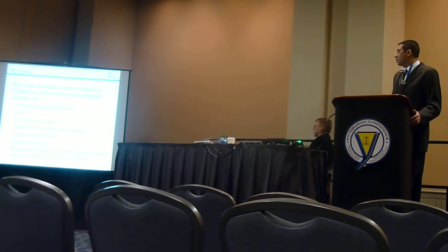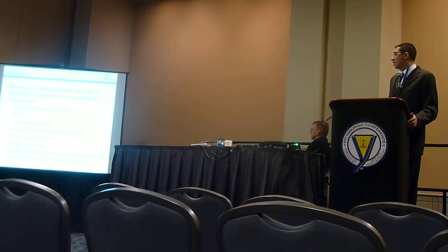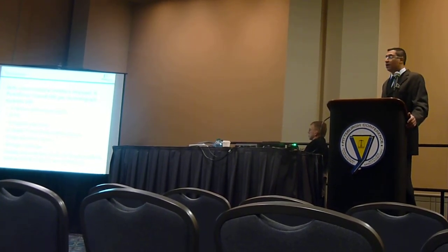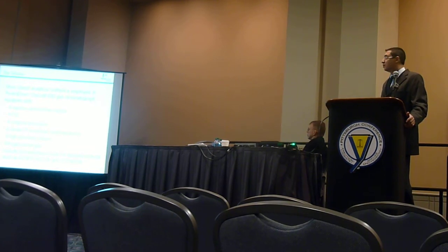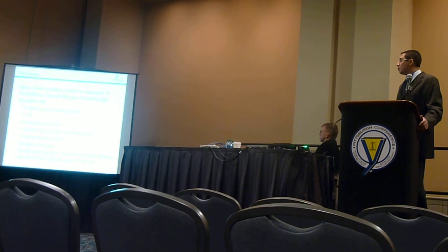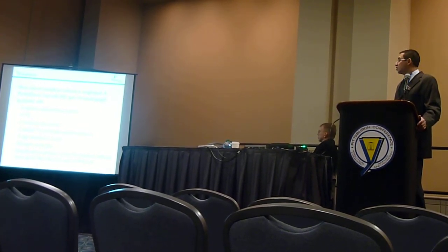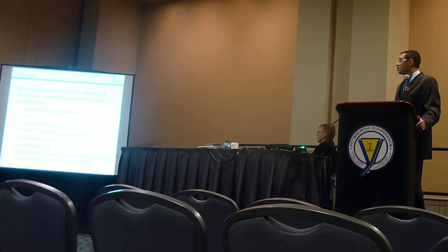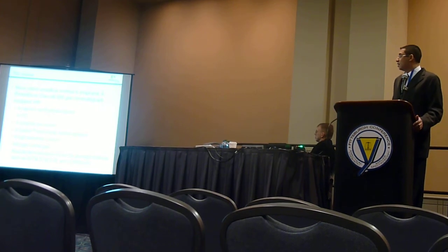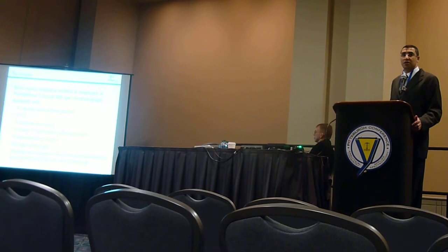So we employ the Clarus 680 PerkinElmer gas chromatograph. It has a split injector, a flame ionization detector, a non-polar pre-column that separates components based on boiling point, and then a Swafer, where the heart of the experiment, the switching, will happen, and then a high selectivity column. We use a nitrogen carrier gas. And after I demonstrate the experiment, we're going to discuss that versus the standard methods.